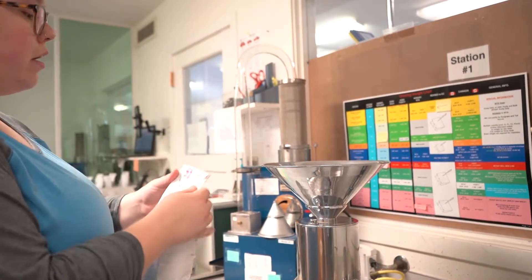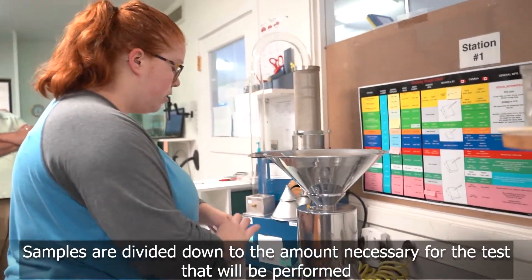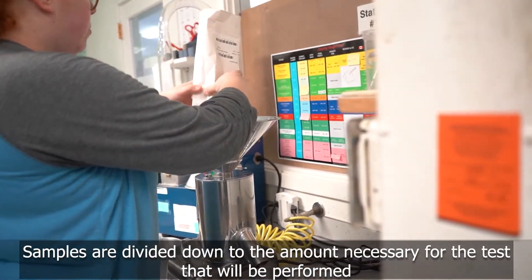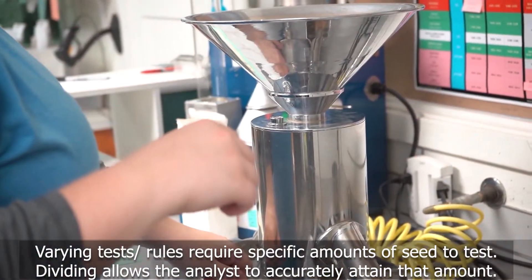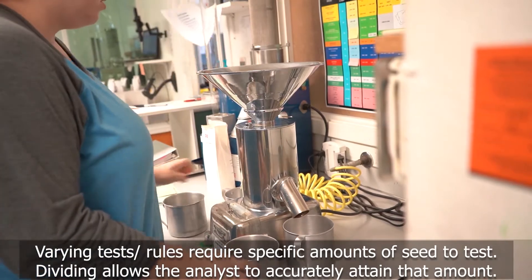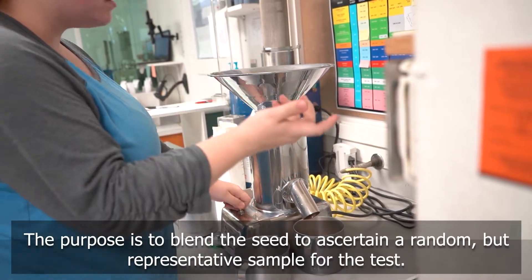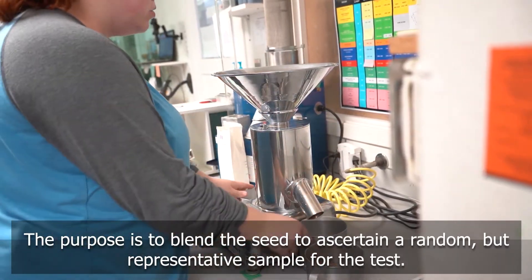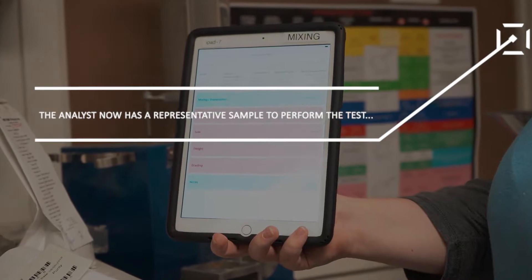Otherwise, we are fluctuating what we're doing and it's not as accurate as we would like to. The samples come sealed so that we know that they haven't been tampered with. So this is where we break the seal. I'm going to homogenize the sample before I weigh out any of the portions, just to make sure that we're getting a representative portion of the seed. What the divider does is it basically takes all the seed, spins, and dumps it evenly into the two cups that are on either side.